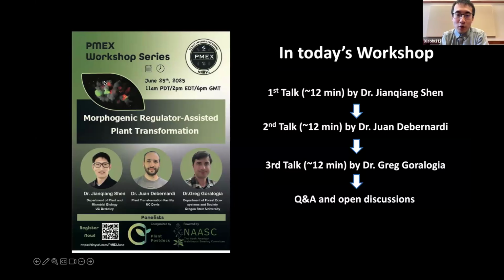Next, we have a general question. What would you say are the most promising genes for increasing plant regeneration? If I had to say, I would test all of them and combinations of all of them. In my experience, GRF-GIF works well, but we used GRF-GIF in a protocol that was already very good. It had a low regeneration efficiency, but all the cell biology and tissue culture was fantastic, and GRF-GIF works well on that.